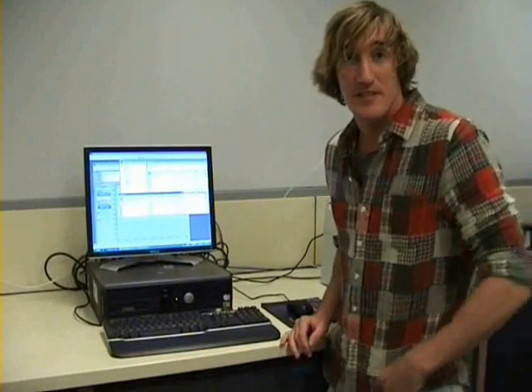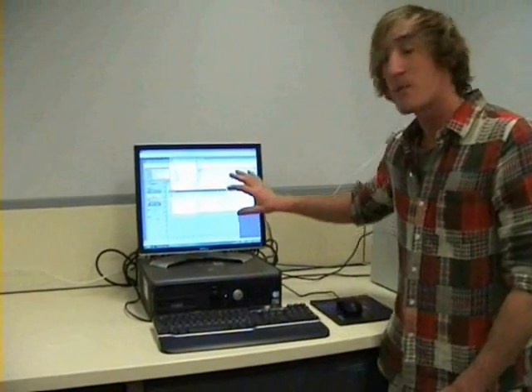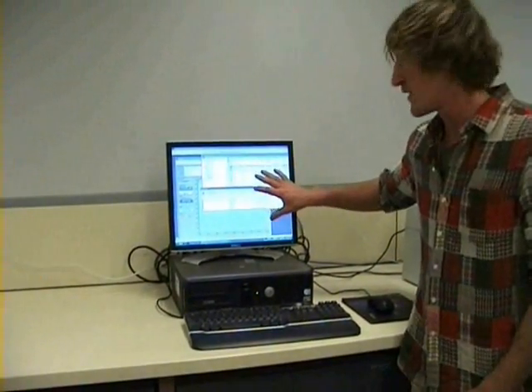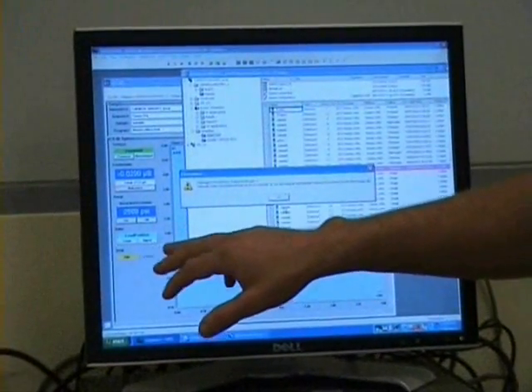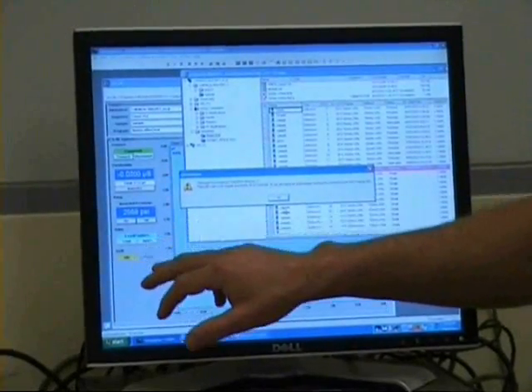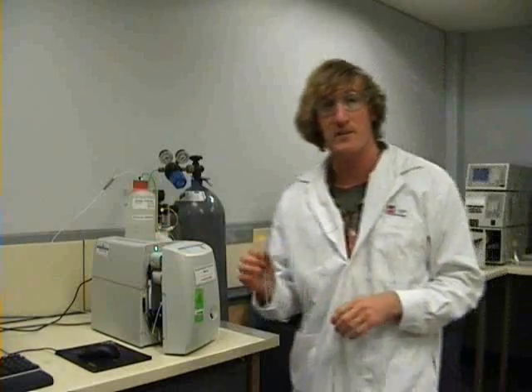When the system is ready to receive a sample, this is indicated by a pop-up box which appears on the main screen, telling you that it's okay to load the sample. This is also indicated by the valve status down here in the corner, showing that it's in the load position. Now that we're dealing with our sample, it's important that we use proper safety gear — in this case, a lab coat and safety glasses.